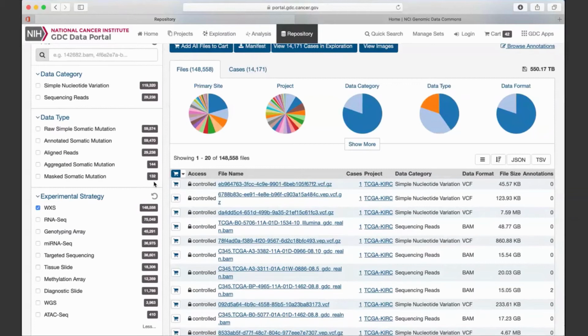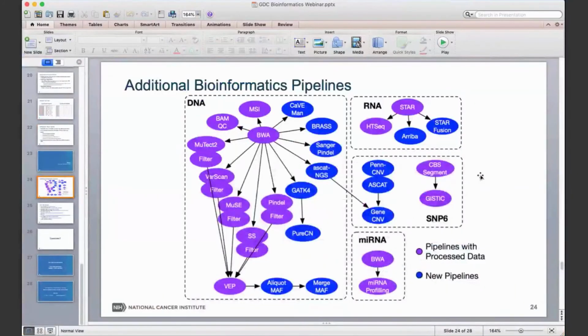Okay, we have another question. What is the copy number resolution with the two software mentioned? And are there any limits of detection specified for the data sets? Oh, so the two software from Colin's slides, well, actually both are ASCAT. One is ASCAT for the SNP platform. The other is ASCAT for the whole genome platform. We haven't looked carefully at that.